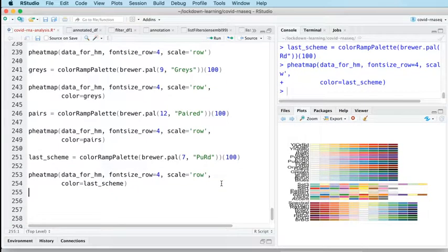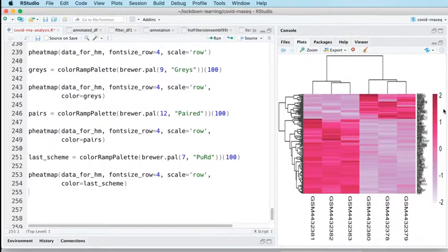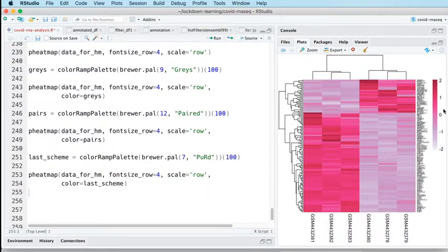Okay. Oh, that's even... See, that goes to show I have no design sense whatsoever. That's hideous. Oh, that's awful. Okay, you should take these decisions out of my hands and not let me design color schemes ever, because that's hideous. Okay, I'm going to stop there. Discretion is the better part of valor. I'm going to stop making up horrible color schemes, and I'm going to leave it there.